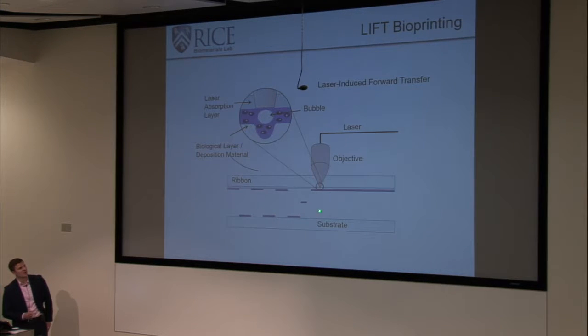So you can see right away we're kind of limited to more or less 2D structures, but because we're using this laser to get these focused jets, we can create really fine-tuned cellular patterns on our surfaces, and we have really nice high resolution.